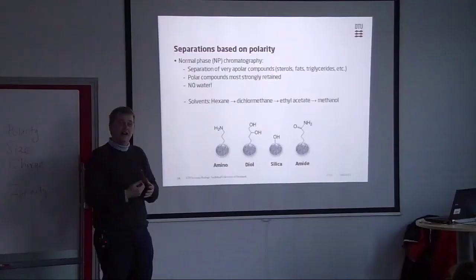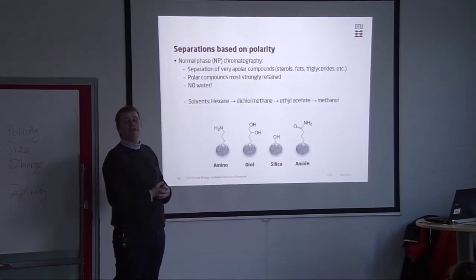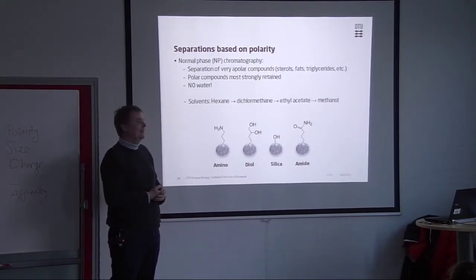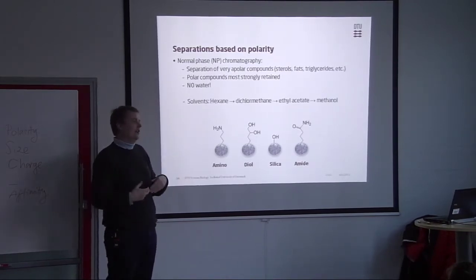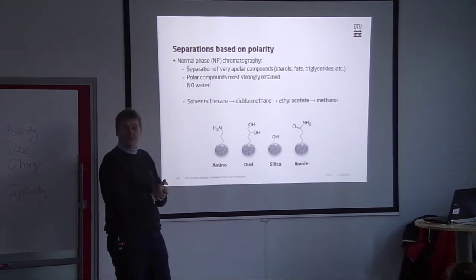Because when you have the silica, all these different cross links that you saw in between can be broken by water, they can be hydrolyzed, and that will change the chemistry of the particle. So actually, when you work here, we also have some small one-time use columns we can use to purify. And in those, you have to dry them in an oven. And you will also see working in the summer, when it's very humid, they will not work as well as now, where everything is dry.